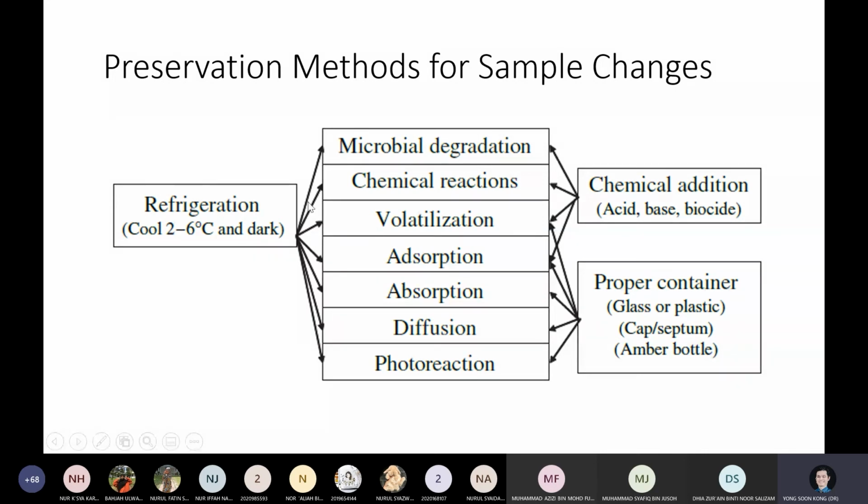Okay, now that is just one way. The most straightforward and simplest way to do it. But there's another way. If you know that a certain method allows you to use chemicals, what we call preservatives, you can also use them.